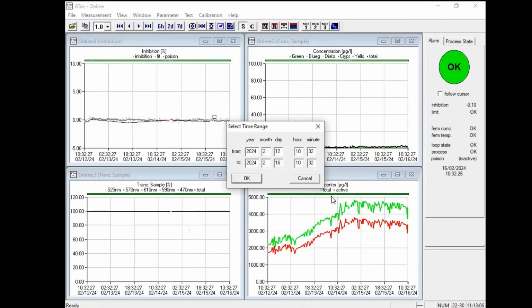All the parameters, all the recorded data of this time span are put into the database, so we know all the messages, all the recorded problems, everything which is used for generating these data points, we will see in the database. So if you have a problem, we want to have an exported file.